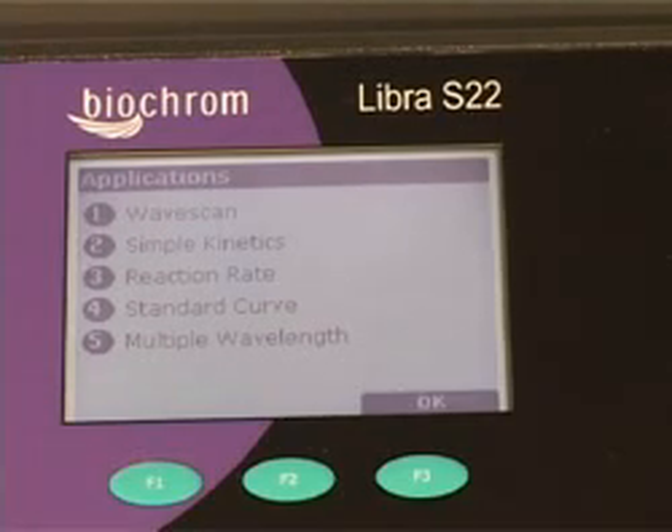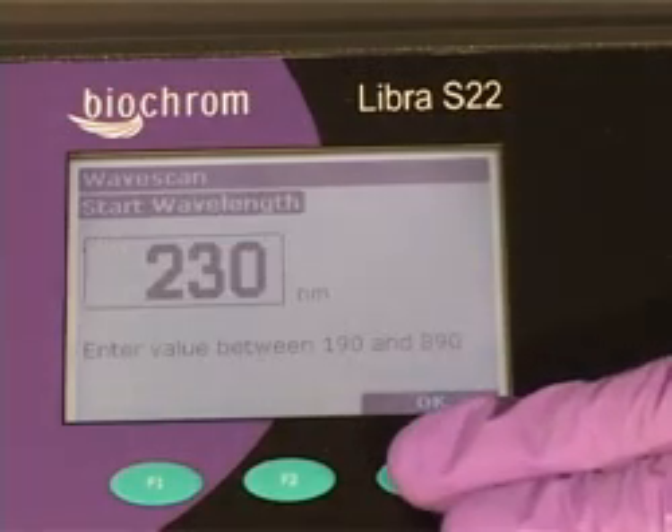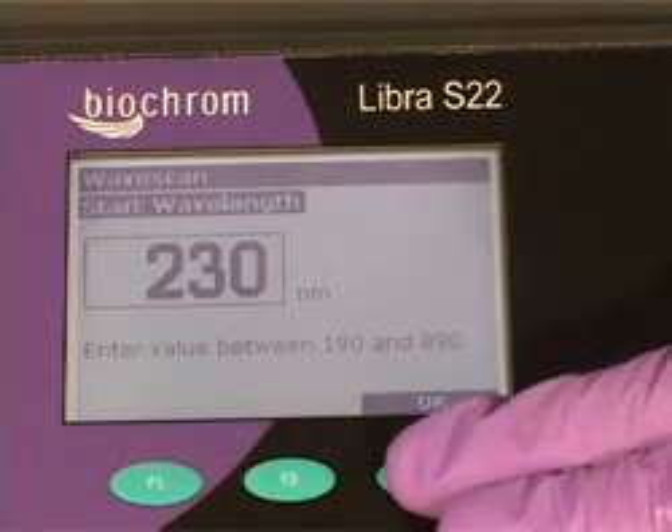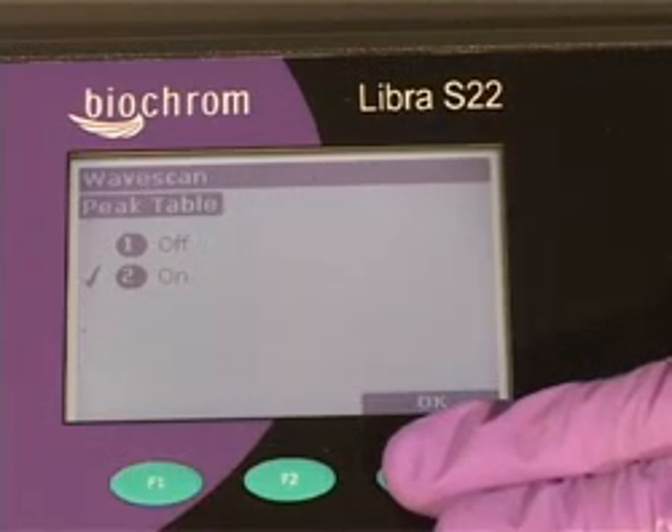To carry out a wavelength scan, press 1, select the data mode required, enter the start wavelength, enter the stop wavelength, and choose the scan speed and if you want any peaks to be picked.